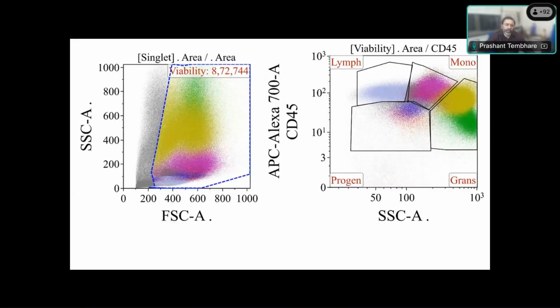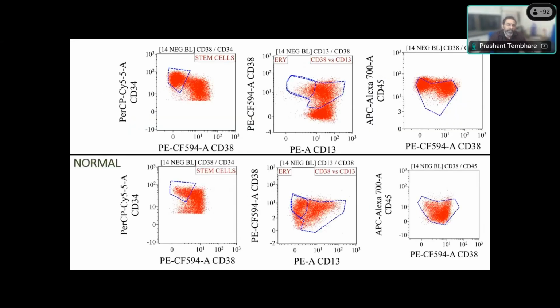So bone marrow classically represents, as I showed, hypogranular cells. You can see the side scatter is not nicely high. You can see there is a subset of cells which are almost touching the monocyte level. That means there is a loss of side scatter, which indicates hypogranularity, which we have seen even in the morphology. And then we see there was some blast.